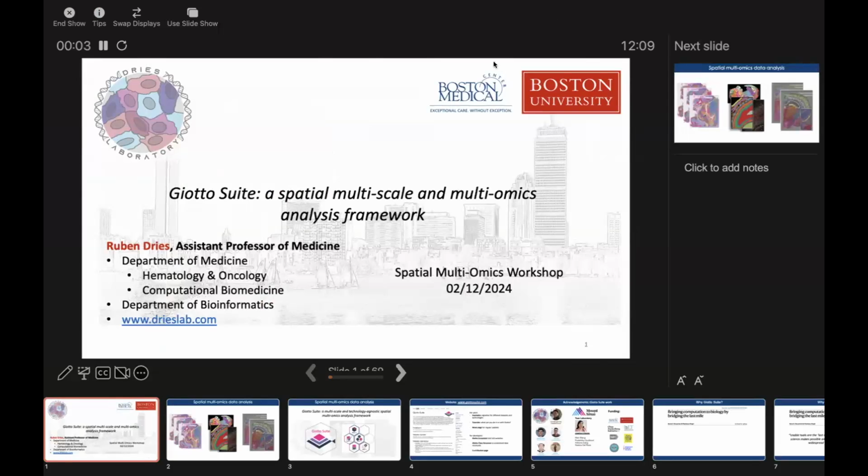All right, thank you so much for the invitation. I'm really excited to be here. And also thank you, Ron, for giving a beautiful introduction to why we actually developed GIOTTO Suite, which is a spatial multiscale and multi-omics analysis framework.